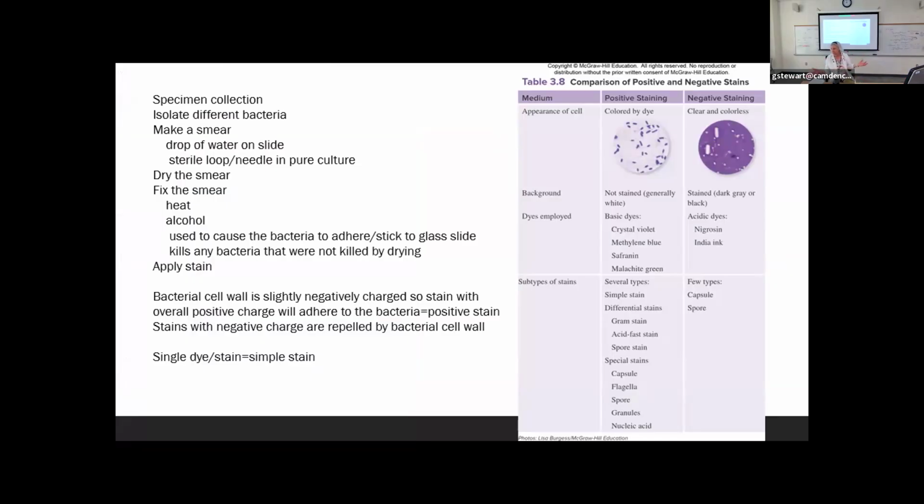Like I didn't draw a picture of a microscope or a compound electron microscope. So some positive staining, negative staining, and some of the dyes that we might use for those things, right? You saw we used methylene blue. We can easily use the first dye of the differential stain, which is a crystal violet. It depends on how you make it. If you make it acidic or if you make it basic, you can use it as a positive simple stain or a negative simple stain, right? And that's similar to what we saw under the microscope. This is a little more purpley than we had, but nonetheless.